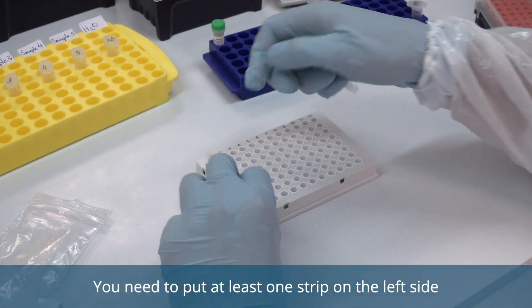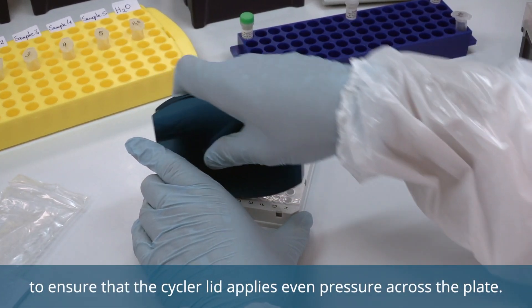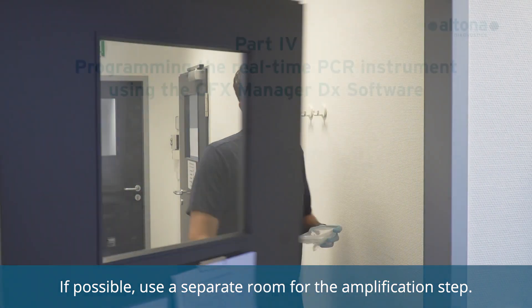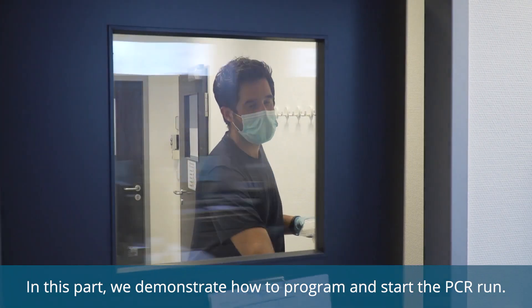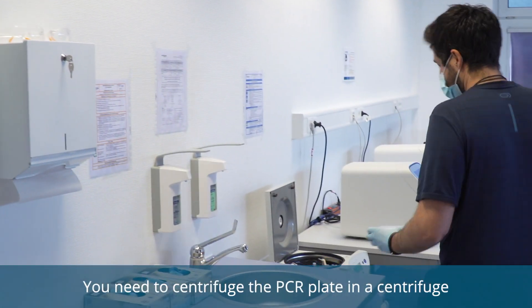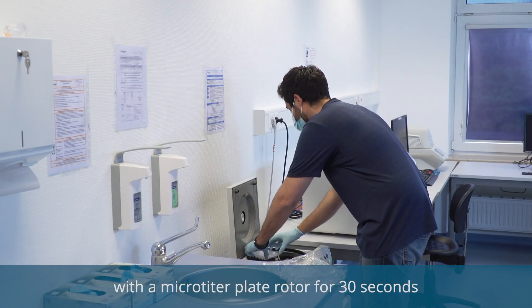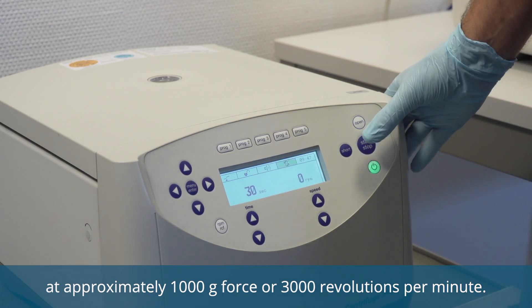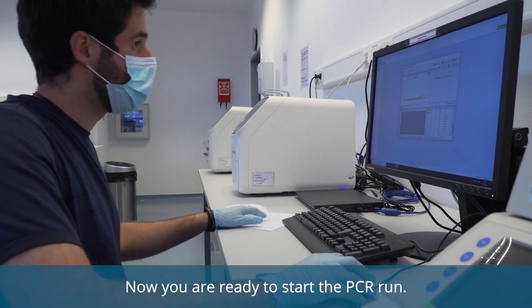Precisely seal the plate with strips. You need to put at least one strip on the left side and one on the right side of the PCR plate to ensure that the cycler lid applies even pressure across the plate. If possible, use a separate room for the amplification step. You need to centrifuge the PCR plate in a centrifuge with a microtiter plate rotor for 30 seconds at approximately 1,000 g-force or 3,000 revolutions per minute. This way, all the liquid collects at the bottom of the wells. Now you are ready to start the PCR run.